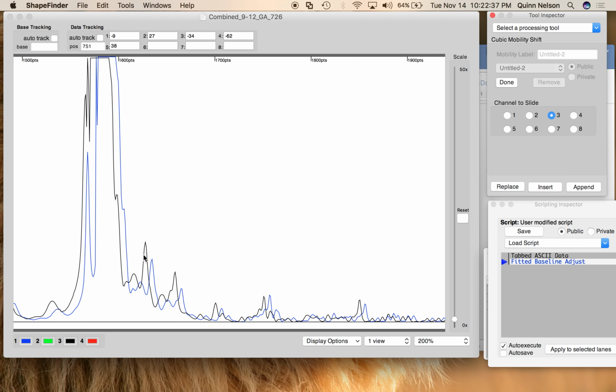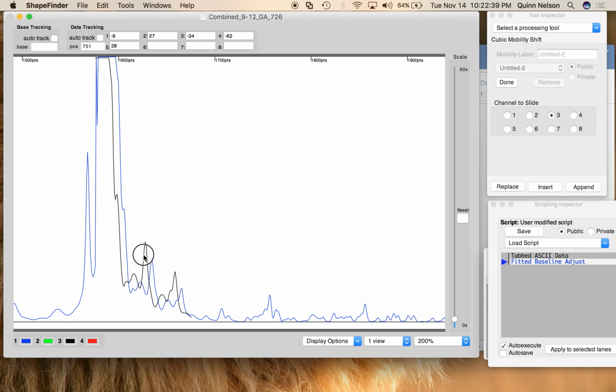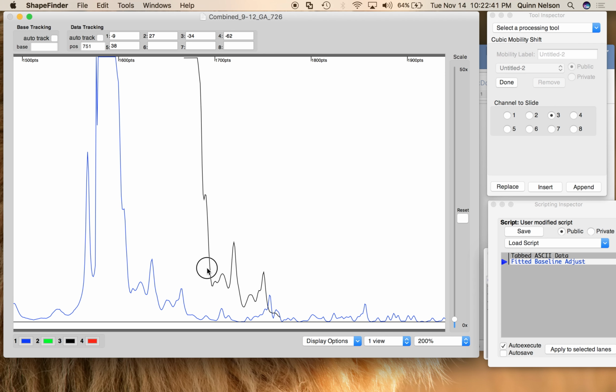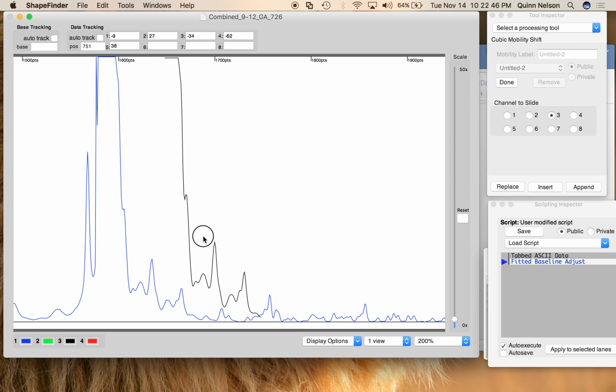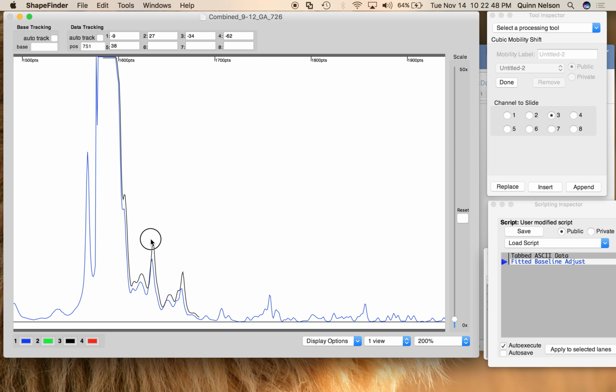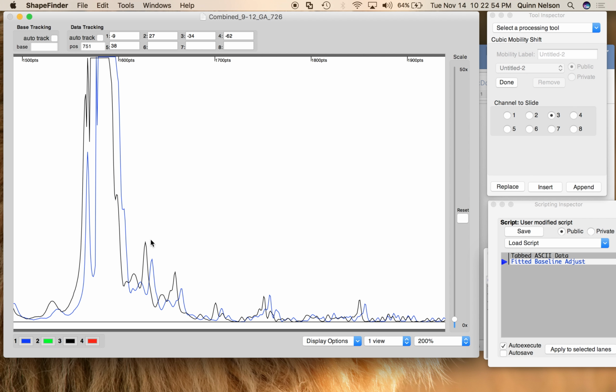So when you click in this screen, you click and drag. See, it's only highlighted a certain piece of the electropherogram. This is going to take a little bit of time to get used to, but this is how you align it. So see this, that's a good alignment. So I'm going to stop, lift up, and it goes back. Don't panic.